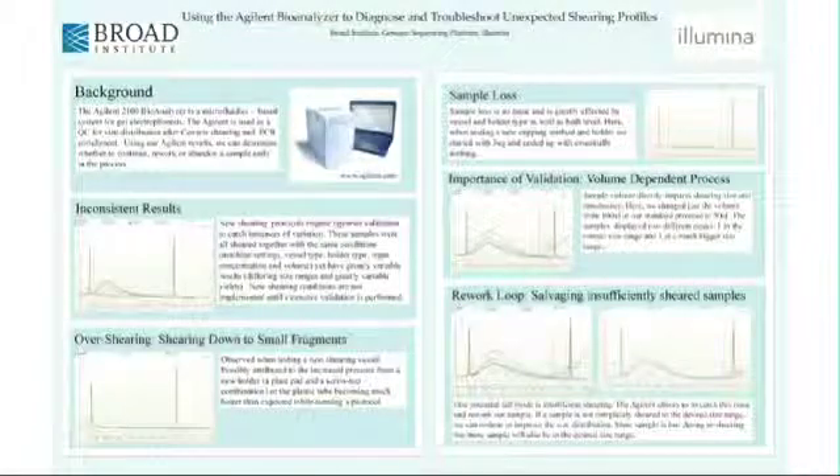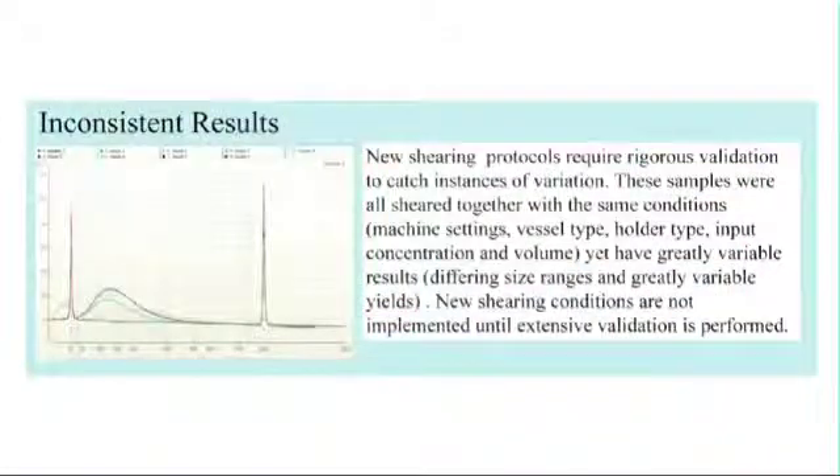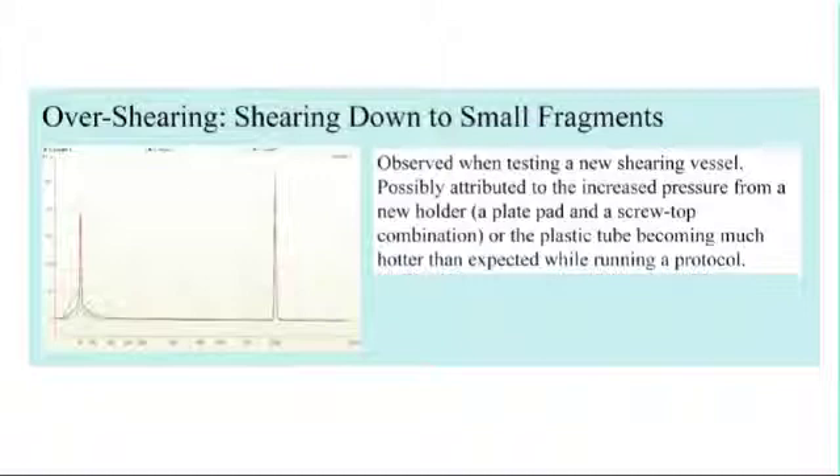The Agilent Bioanalyzer has been extremely useful in our exploration of the Covaris and in trying to optimize our shearing conditions. Throughout the years, we've tried a number of methods for shearing, and the Agilent has helped us visualize the results for each experiment. This poster reinforces the need for validation before you implement any shearing conditions or any new protocol. You can see that all of these samples were sheared using the same Covaris protocol, but altering the tube material, type of tube holder, and starting DNA input amounts had an impact on the results. Before using a new protocol or implementing any changes, you really need to thoroughly understand the consequences.